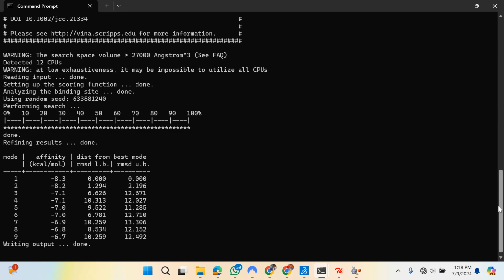Once you hit your enter button to run, the scores are always negative. The lower the value, the better. If you remember the file we used yesterday, they are reporting RMSD value, binding energy, and some amino acids.